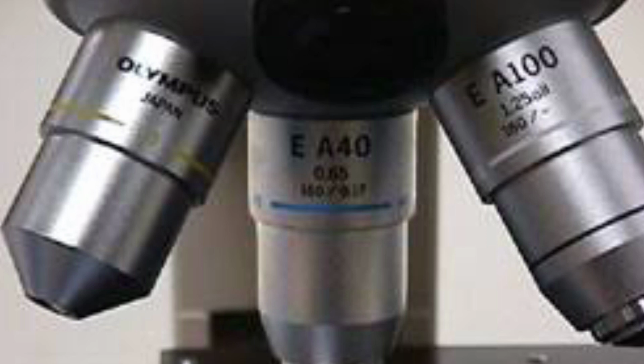Then finally, we have approximate resolving power. For the scanning objective lens, we have 2.3 micrometers. Low power objective lens, 0.9 micrometer. High power objective lens, 0.35 micrometer. Oil immersion objective lens, 0.18 micrometer. All right, so now let's move to types of microscope.